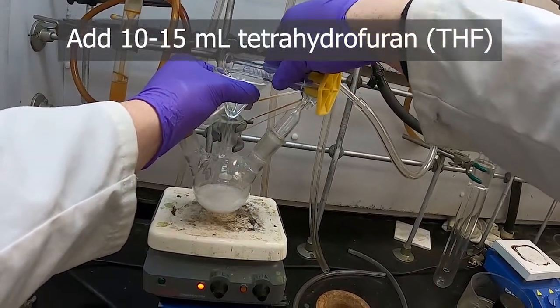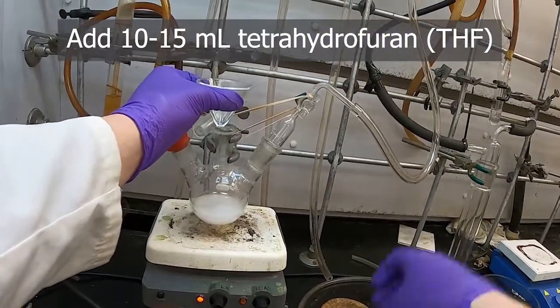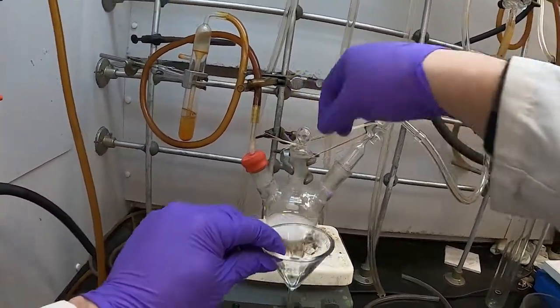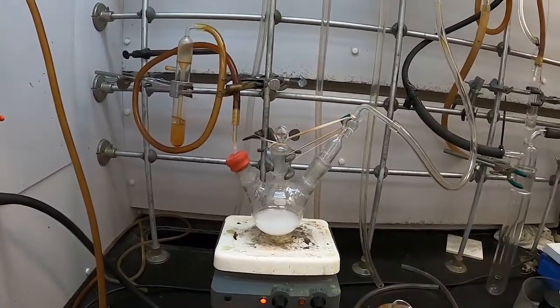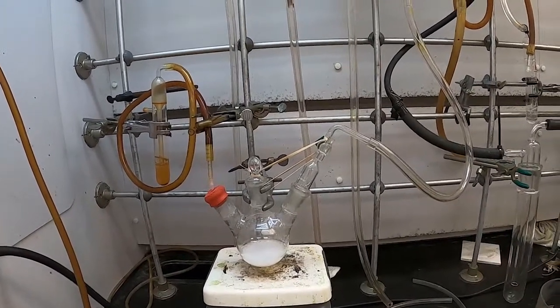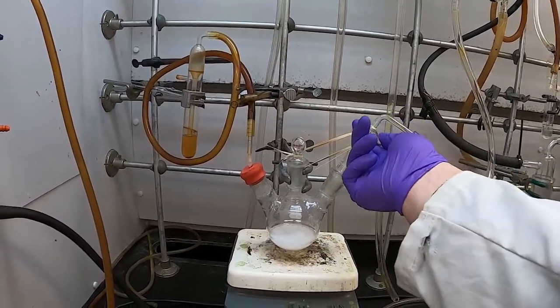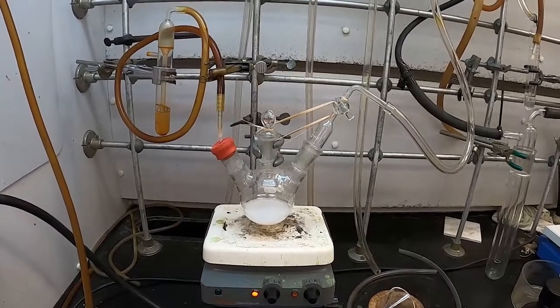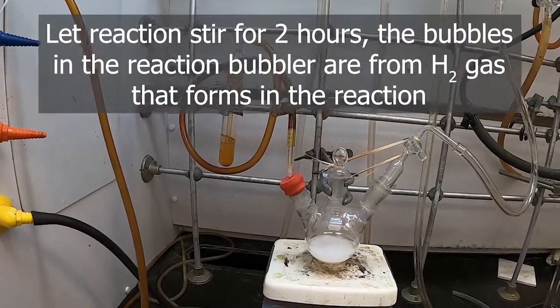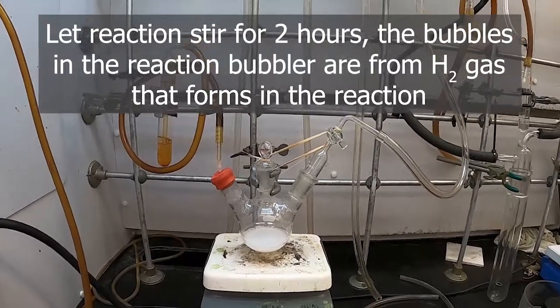Rinse that down off the funnel with another 10 to 15 milliliters of THF. I've got about 12 here. Alright. Once that's added, I'm going to go ahead and turn off our nitrogen flow. Should be okay now. And close this. Now we can see the hydrogen that's being generated is what's pushing the air out of the system, the gases out of the system. So this will need to now stir for 2 hours, and then we'll be back for the next step.